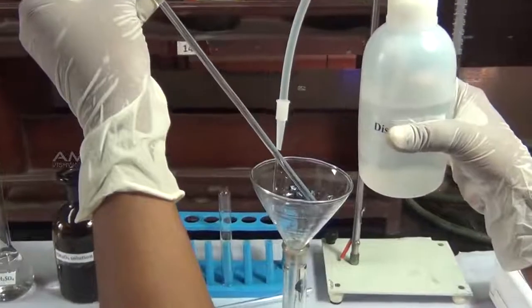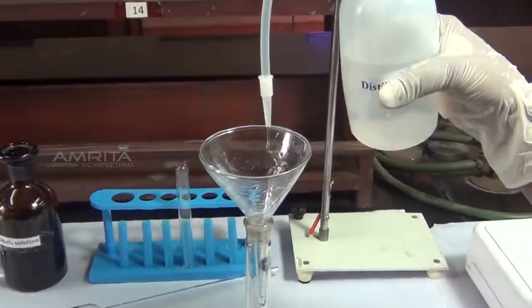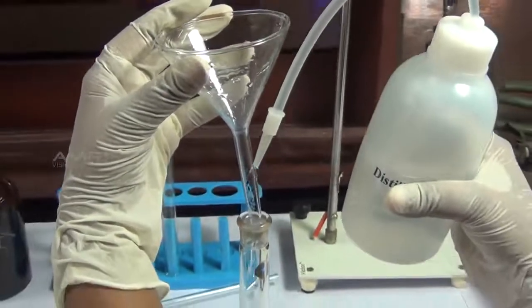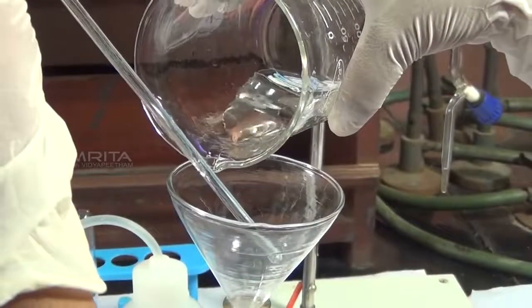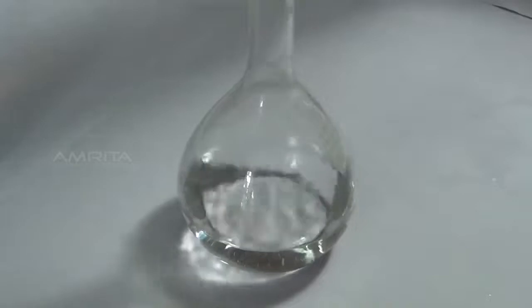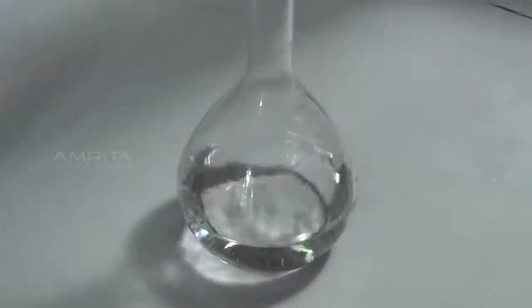Wash the beaker, glass rod, funnel and funnel tip 2 or 3 times with distilled water to be certain none of the solution has stuck to the equipment and that all solution has been transferred to the standard flask.